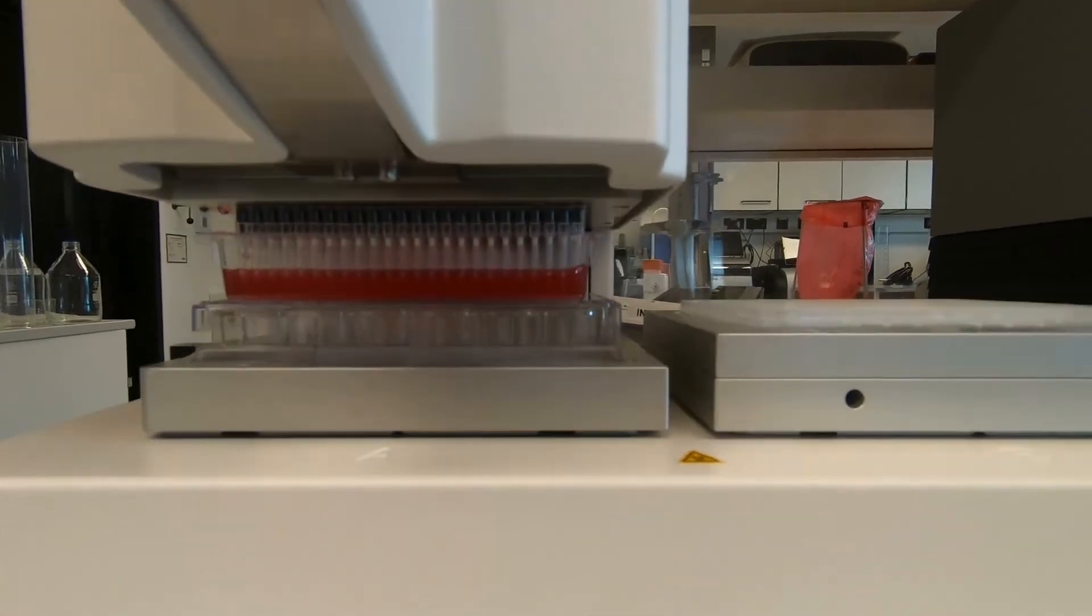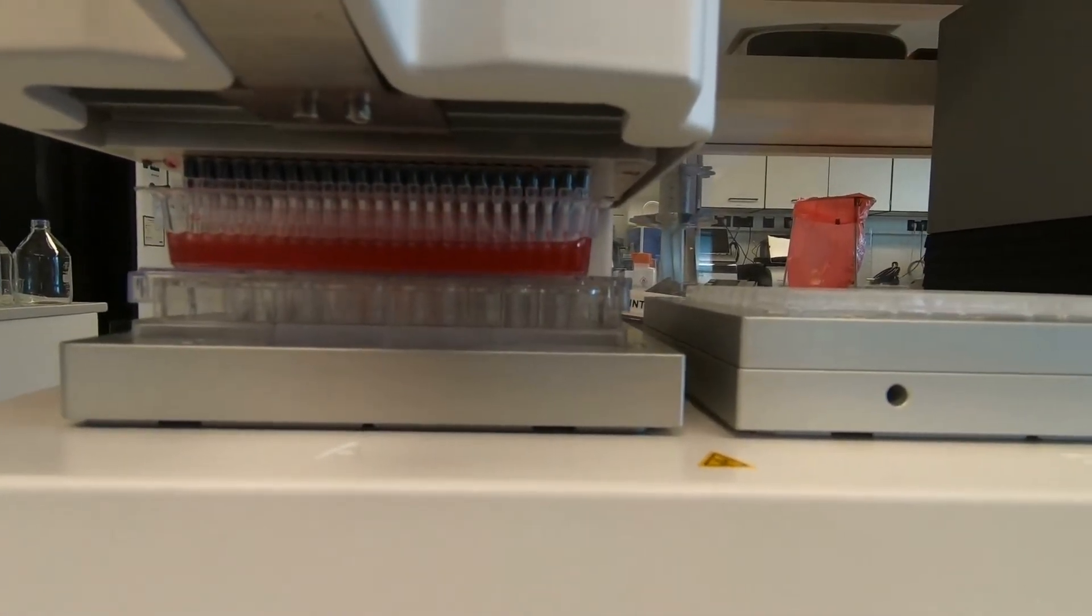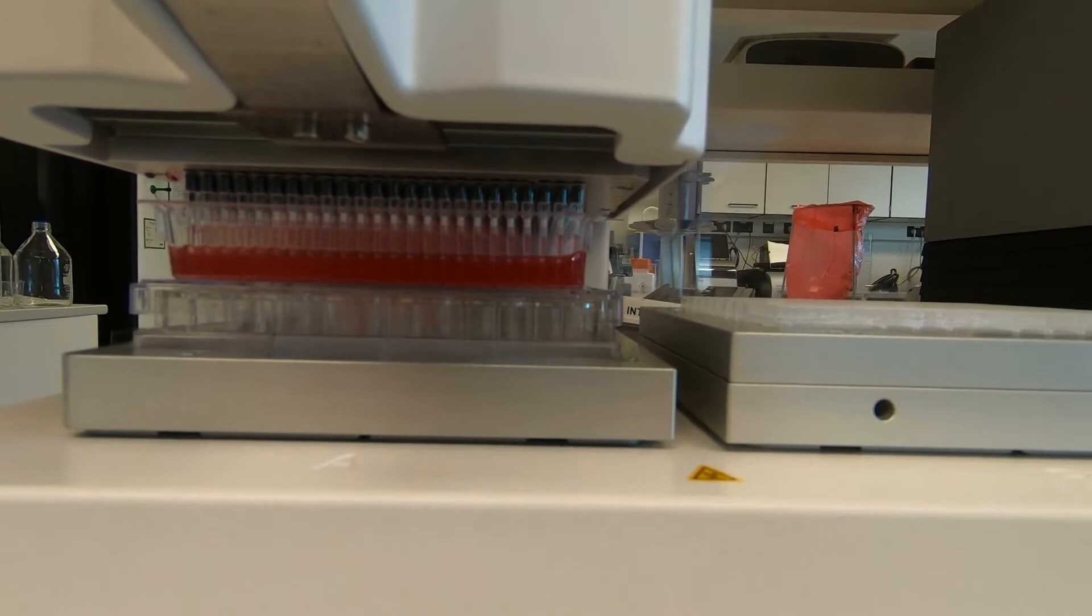What is cell seeding? Cell seeding is the starting procedure for cell cultivation in vitro.